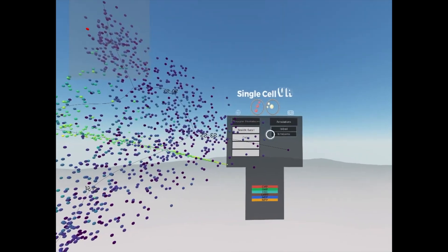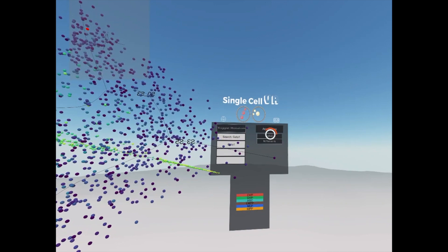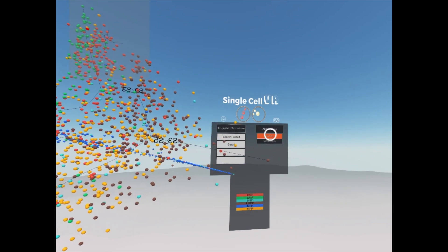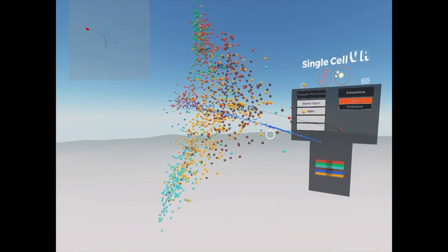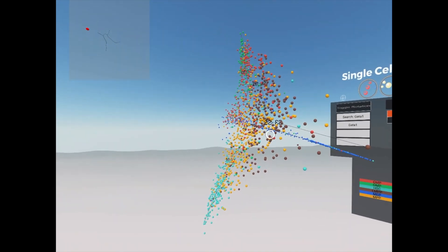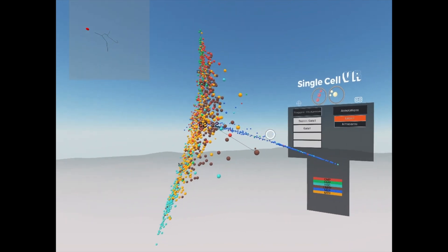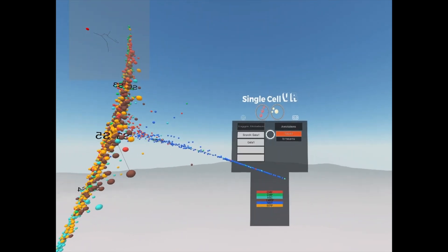We can also recolor the cells based on any set of labels given by the user. Here we can see labels for both the cell types as well as the clustering results.